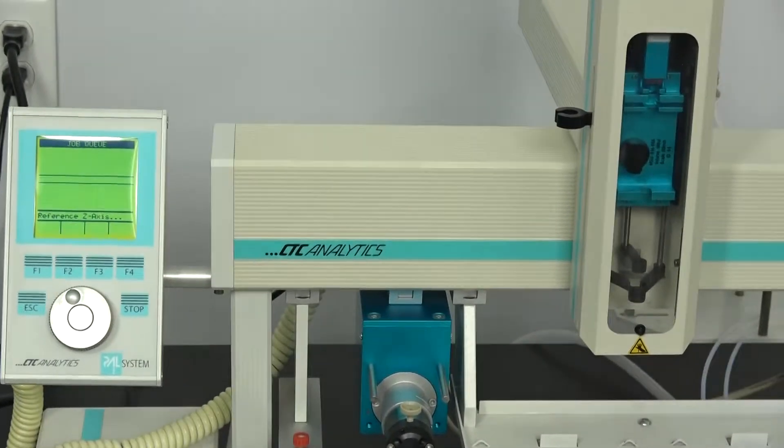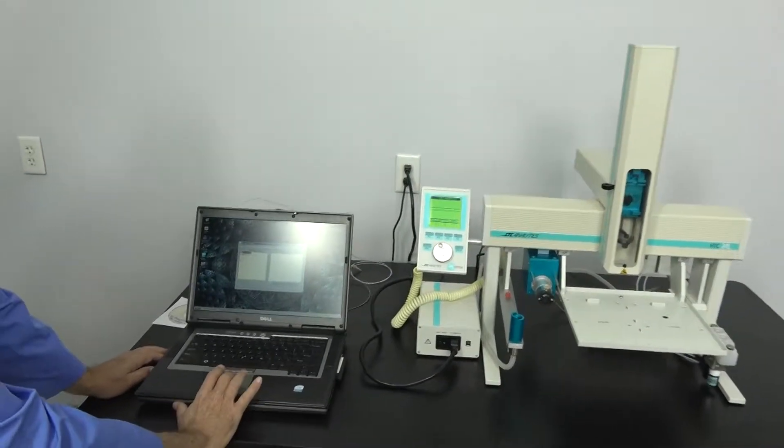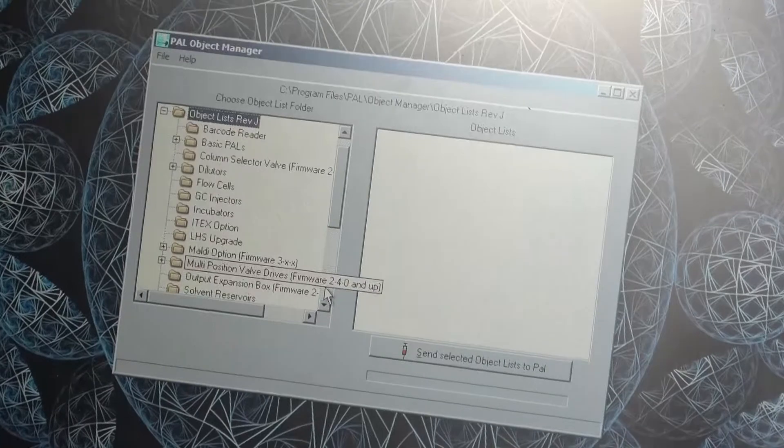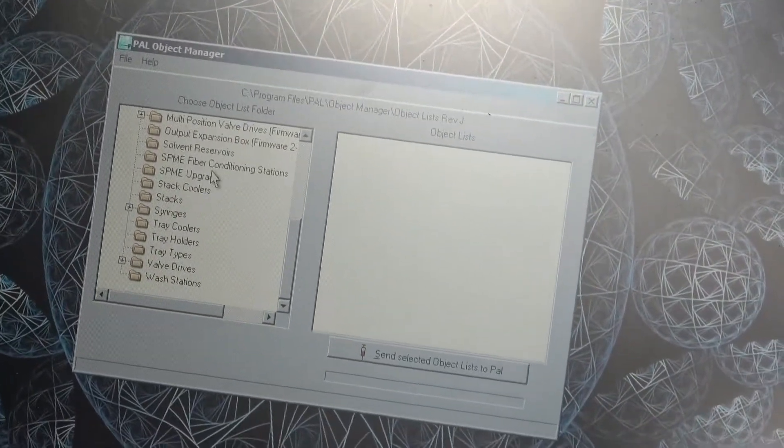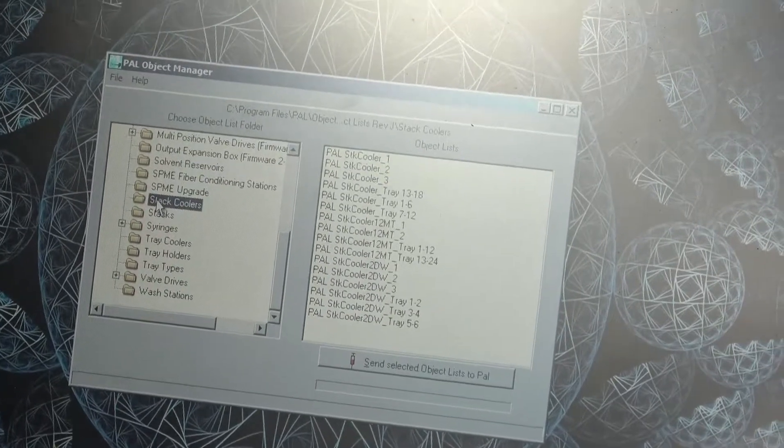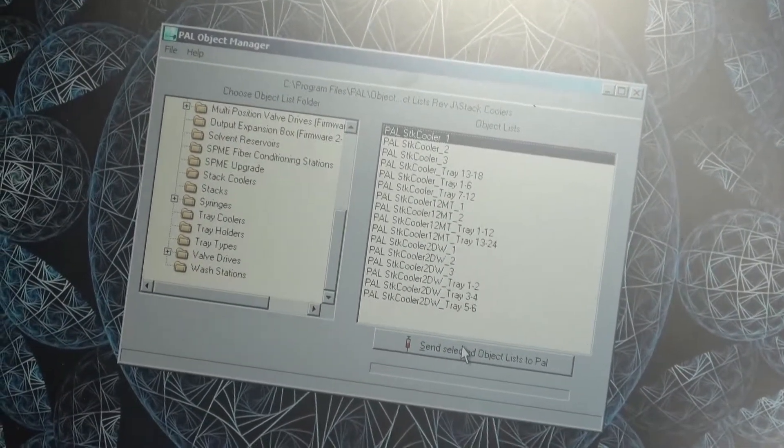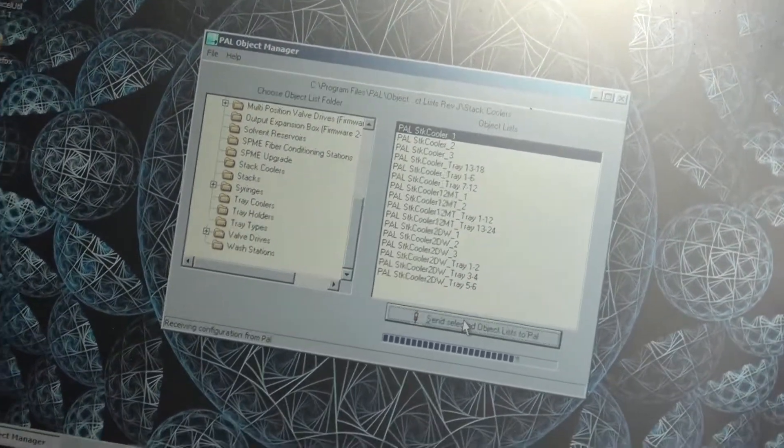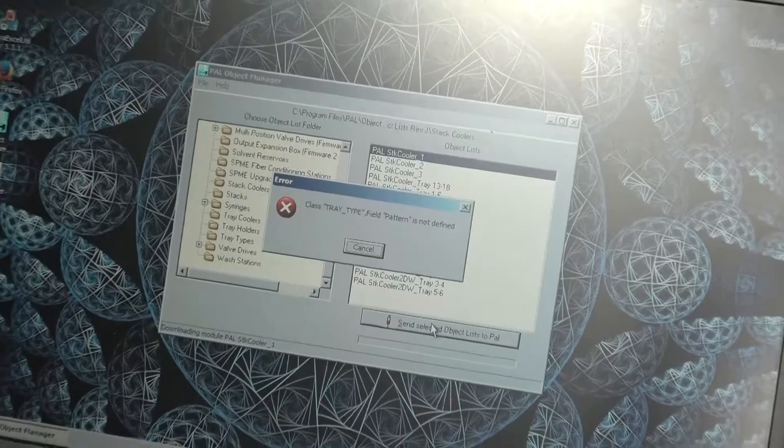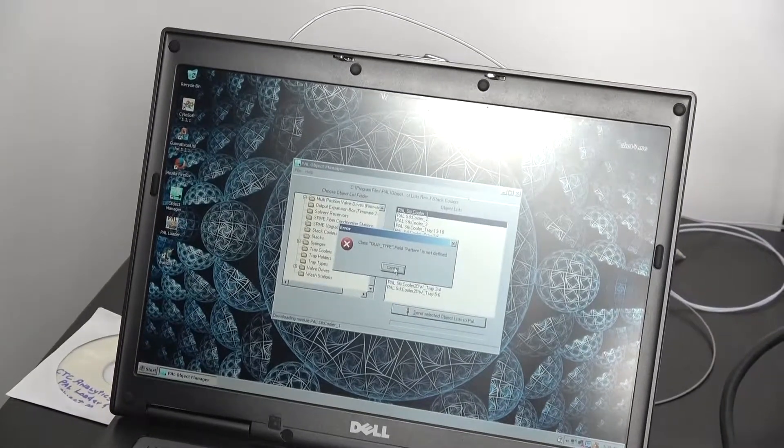Now the object manager is where you teach it how to load different objects. This software is installed on the hard drive and all the list of different objects are there, even some objects that CTC does not manufacture. If we were going to add a stack cooler to this, those would be located in your stack cooler. It's just a matter of clicking and telling it to send the object over to the machine. Because these are such a small controller with limited memory, and because the list is so long, they do not always show them.